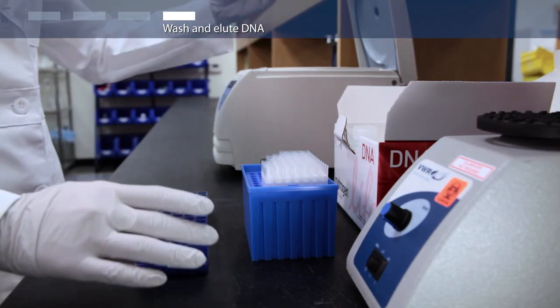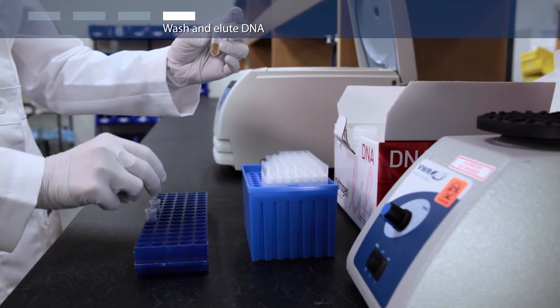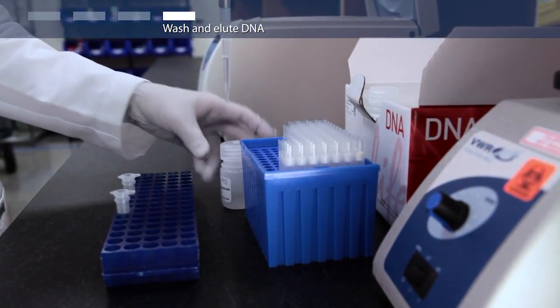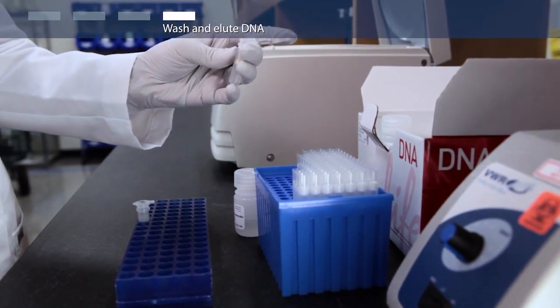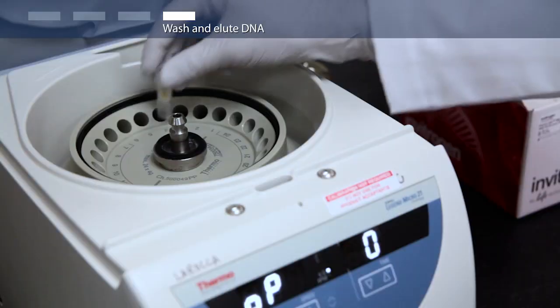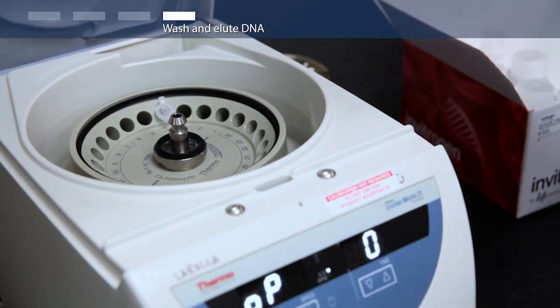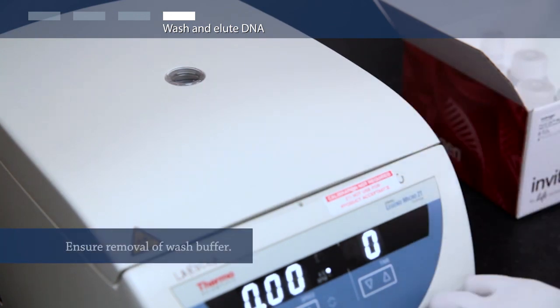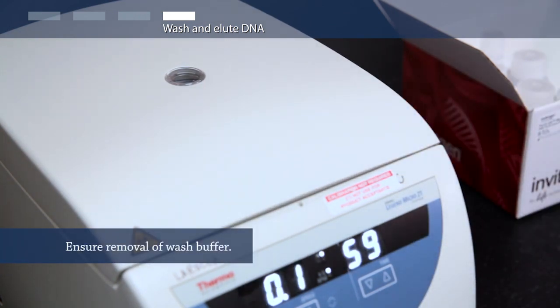To wash the DNA, place the spin column in a clean collection tube and add 500 microliters of wash buffer. Then centrifuge for 1 minute. Discard the flow through and centrifuge again for 30 seconds at 14,000 G. This will ensure removal of the wash buffer, which could interfere with downstream applications.